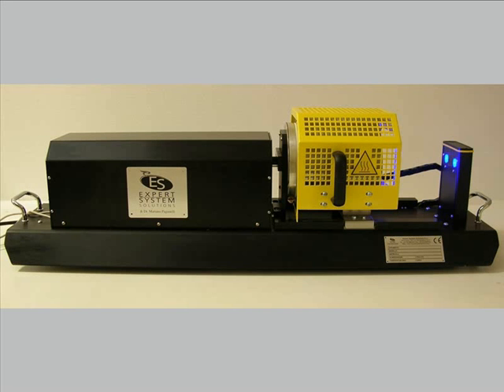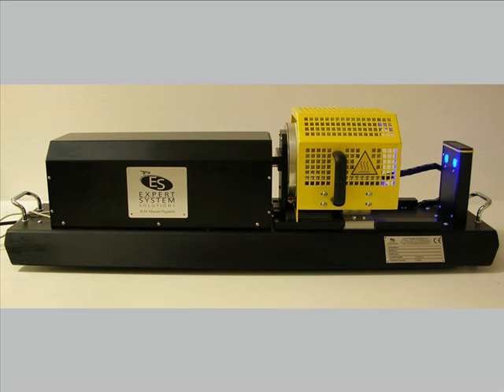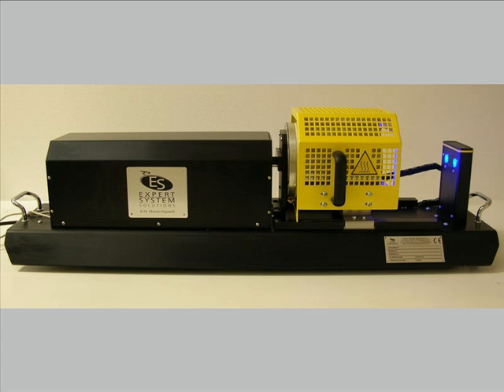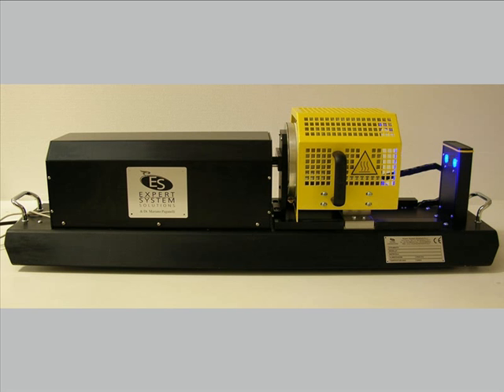Welcome to this short presentation of the Horizontal Optical Dilatometer MISURA LT. The Horizontal Optical Dilatometer was first developed by Expert System Solutions in the year 2002 and it is protected by two international patents. The design is completely innovative and it is based on two microscopic optics with very high magnification which frame both ends of the sample.